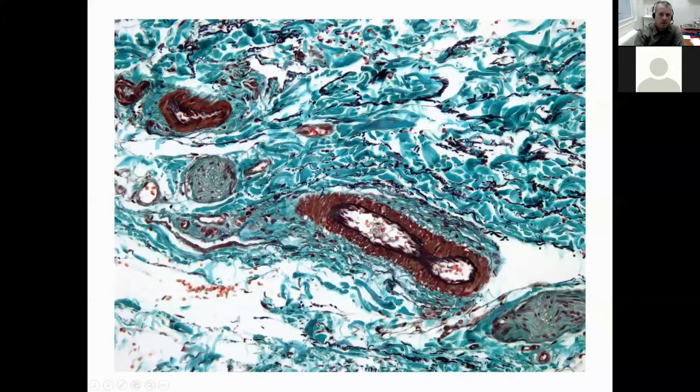And this is a detail from the adventitia showing you some larger vasa vasorum, like this, smaller vasa vasorum. Here, some black remnants of elastin in the adventitia, the green collagen in the adventitia, type 1 collagen, and also the peripheral nerves. This is a nerve, and this is a nerve. We can even tell these are unmyelinated nerves, right? So these are nervi vasorum, and these are the vasa vasorum. You might be asked to demonstrate this during the slide exam. Okay, but it's actually very easy.